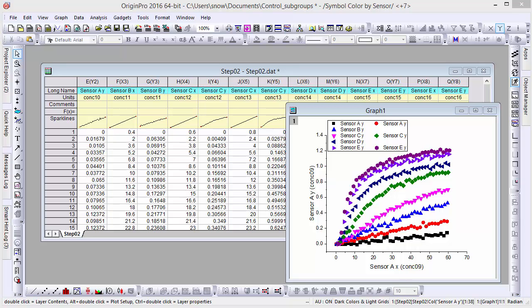In this example, we'll be showing you how to divide grouped plots in a scatter plot showing data from a series of sensors.